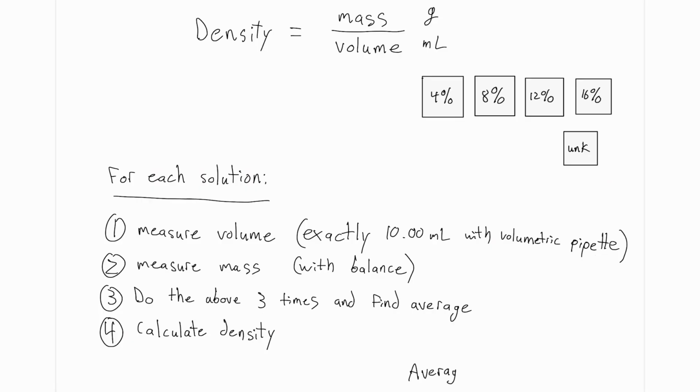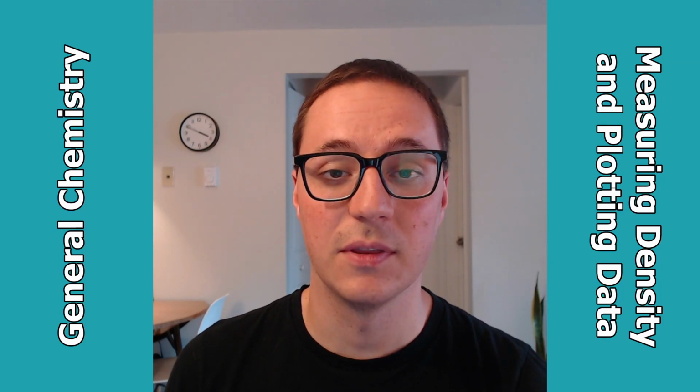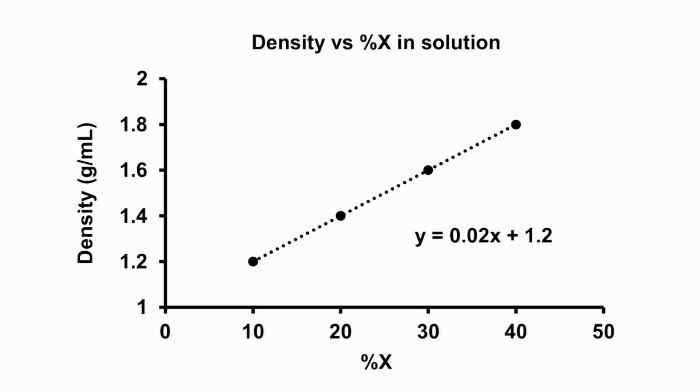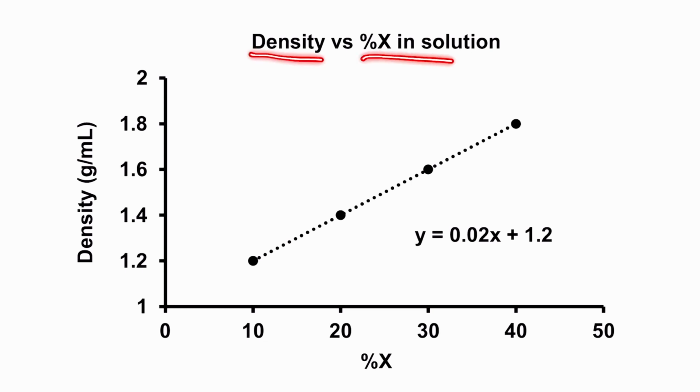If you've forgotten, the average can be found by calculating the sum of the values and dividing it by the number of values. Once we've done all this, we can generate a plot with the 4 standard solutions, which will look like this. This plot uses made-up numbers, but the %x here stands for the solute, which in our case will be sodium chloride. On the y-axis, we've plotted density, and on the x-axis, the % of the solute in each solution. The line formed from the points gives us a visual representation of the relationship between these 2 variables.